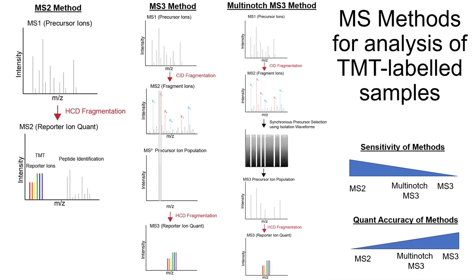And so it's partially that we take advantage of the fact that the mass spectrometer is faster than the chromatography. So I know that that's kind of a little bit of a jargony heavy thing. Does that make sense, Sarah? Okay. All right, so we take advantage of how fast the mass spec is. I think we're good, Caitlin.